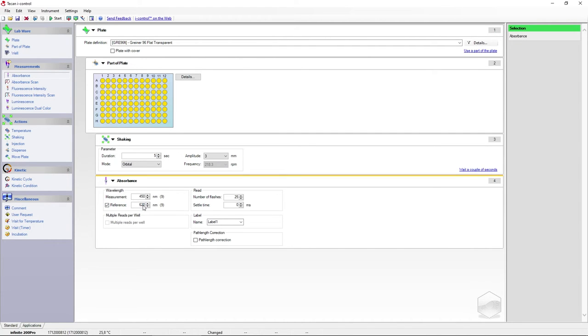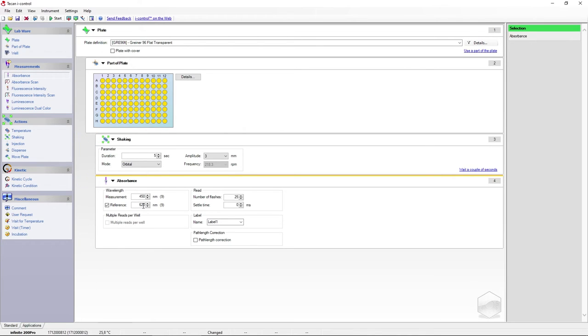For filter-based instruments, define the filter you want to use for the measurement. Note that the measurement parameters are processed in a hierarchical manner from top to bottom. Last, we want the plate to be moved out of the instrument.